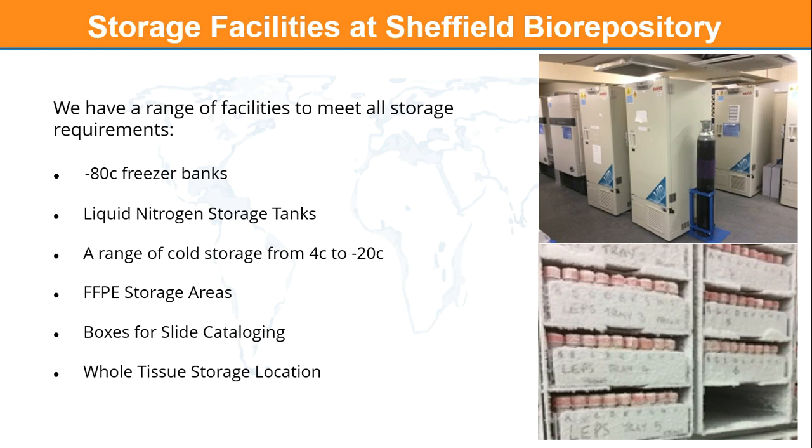Now, these can either be -80 freezer banks or liquid nitrogen bulk tanks, -80 freezers which can each hold up to 20,000 2 ml samples, and liquid nitrogen tanks which are capable of holding up to 80,000 samples in each tank.